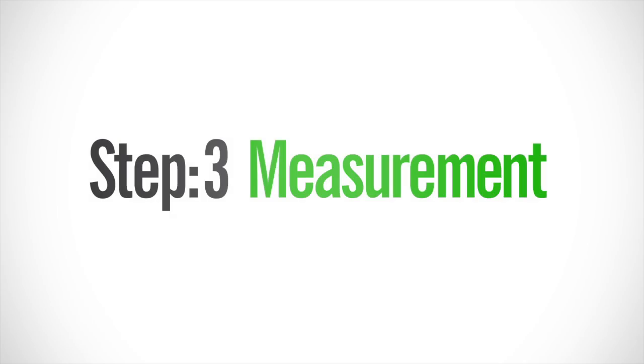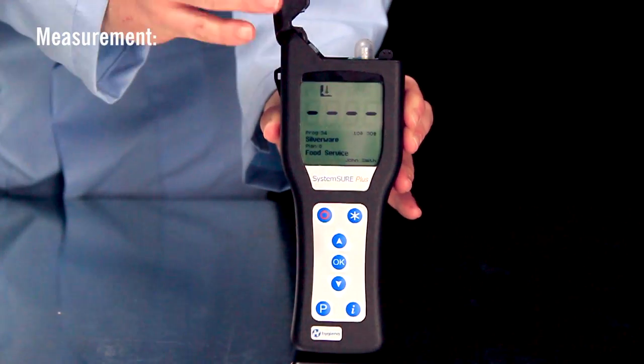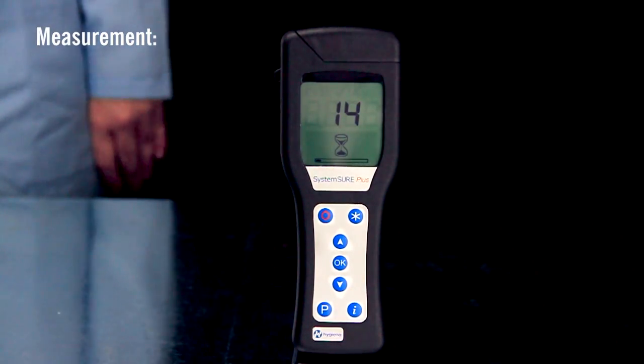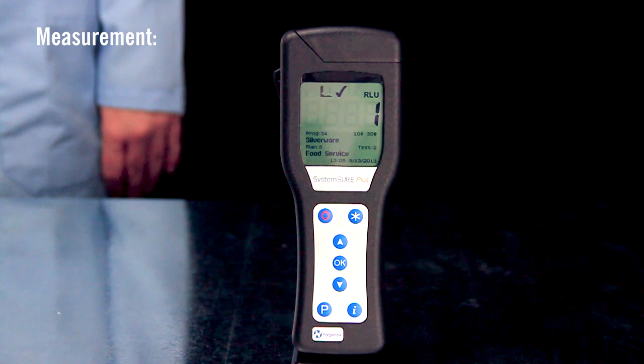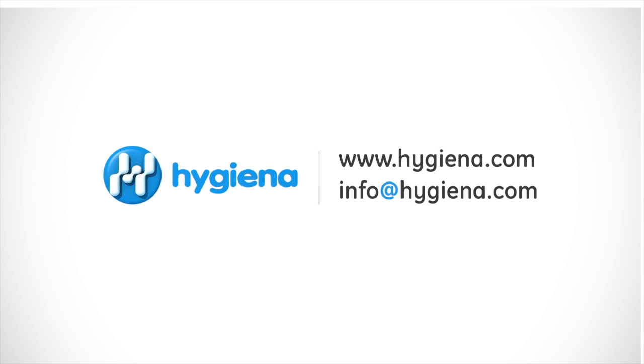The final step is measurement. Insert the test into the reed chamber and close the lid. Holding the luminometer upright, press OK to initiate measurement. Results will be displayed in 15 seconds. Aquasnap devices may be discarded in the recycle bin. For more information about Aquasnap or any other Hygiena product, contact us with the information on the screen.